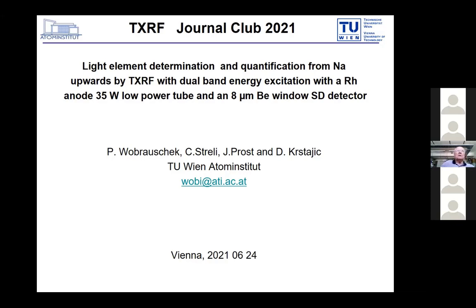I take also this chance to talk about these effects, because I want to fight a little bit against this conventional opinion that light elements is nothing for X-ray fluorescence analysis. And I hope to convince you with the slides and the spectra which we were able to measure.